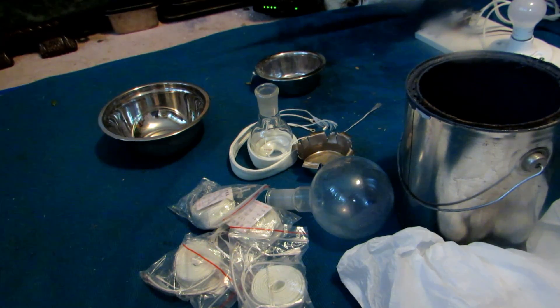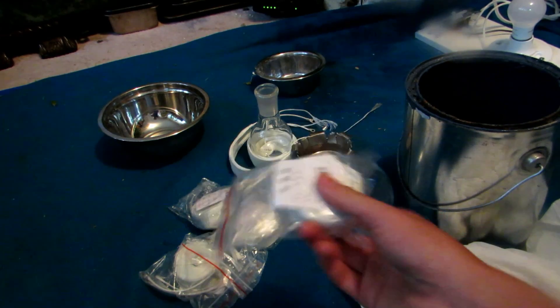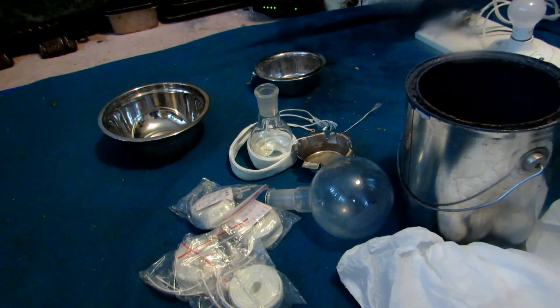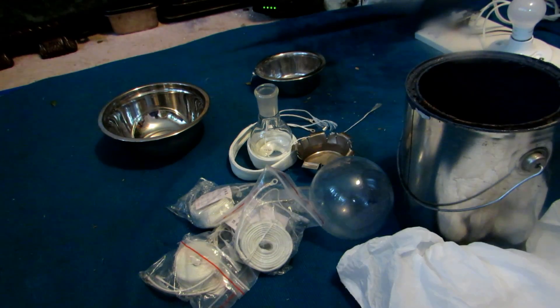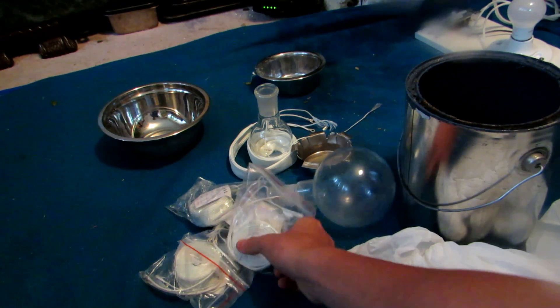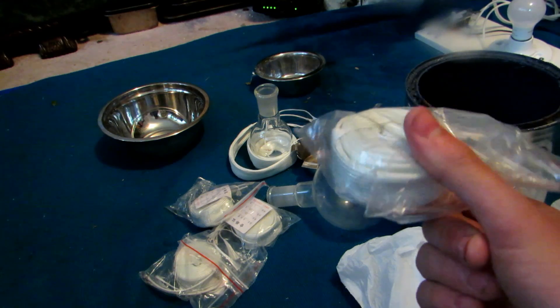I used one of my 500 degree thermometers to test how hot these could actually get, and at 240 volts this very quickly went above 500 and my thermometer blew up, which was not very good. But they definitely go above 500 degrees Celsius. These heating tapes are designed to run at 240 volts, and even at 120 volts these things will get up to 200-300 degrees Celsius.